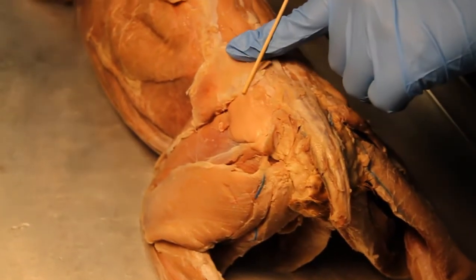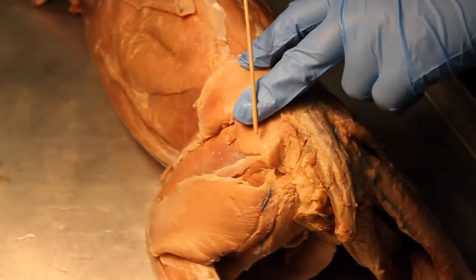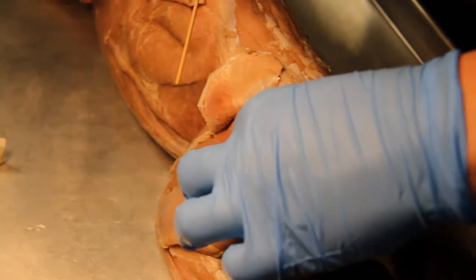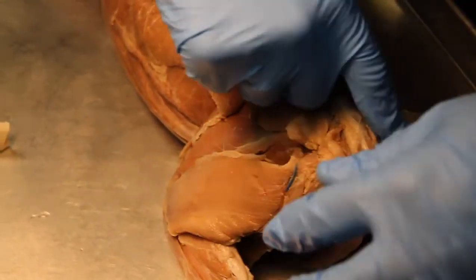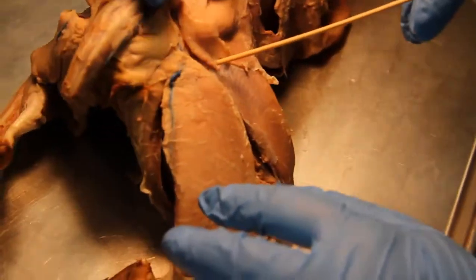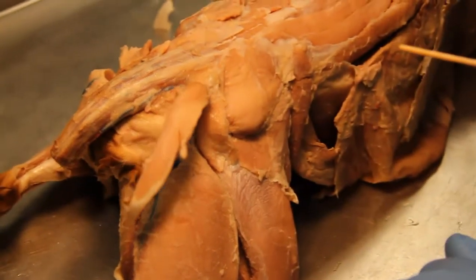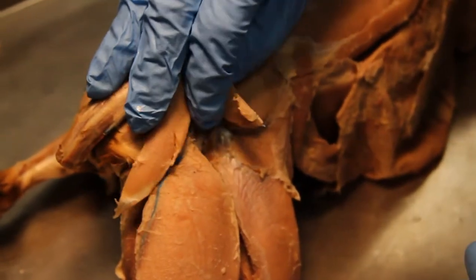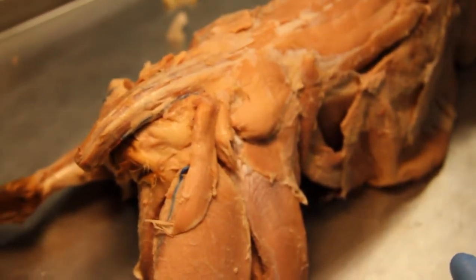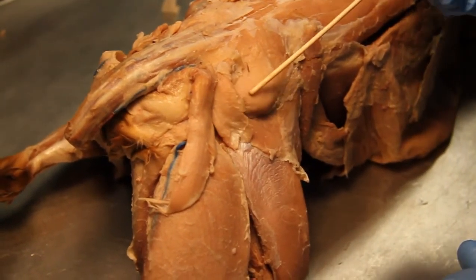It looks like a medius — that is a gluteus medius. Or is it the maximus, maybe? I think this might be the gluteus maximus. Medius? Sorry — maximus. Gluteus medius? Yeah, I think so. So let's do a quick total review of what we're looking at. This is the gluteus maximus, and this is the gluteus medius.